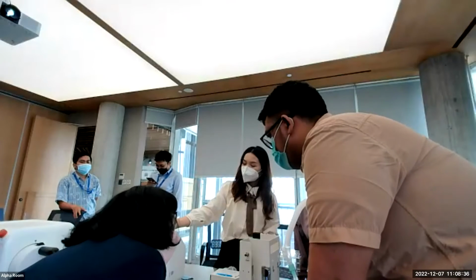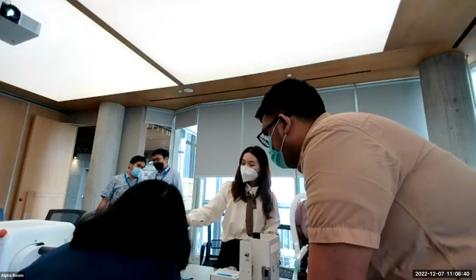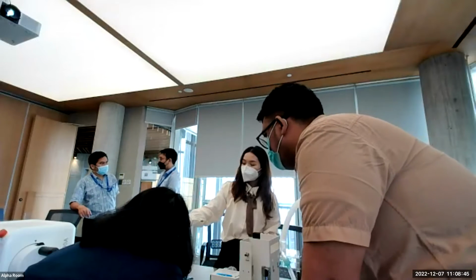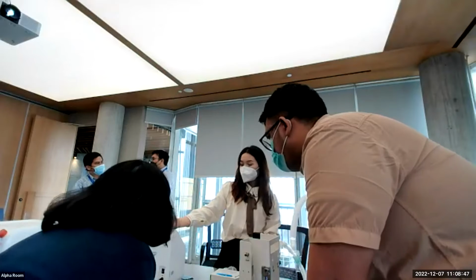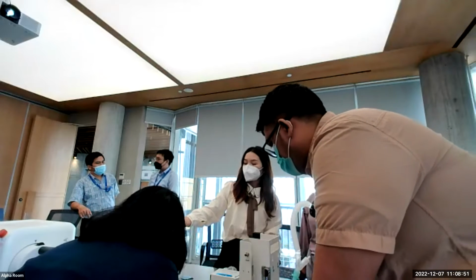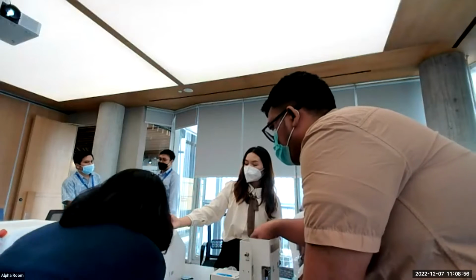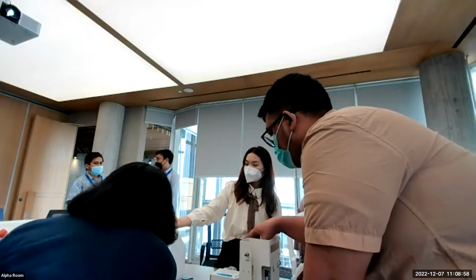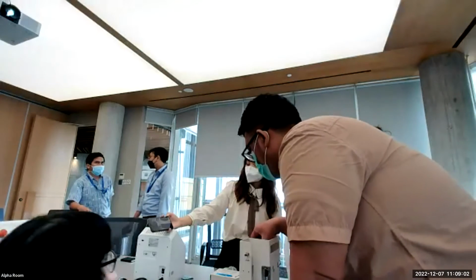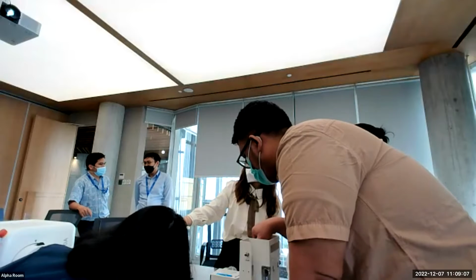And we can adjust the flow rate of the gas evacuation apparatus from this knob. We usually adjust to this place, which is about 30 liters per minute. The max is 60 liters per minute, and this screen will show the flow rate in real time.